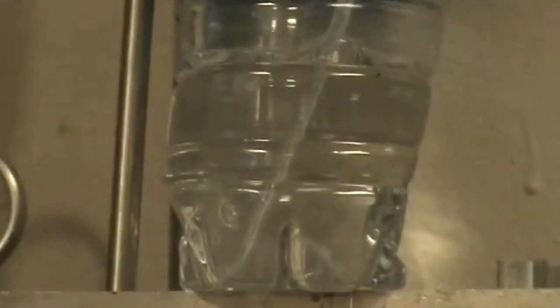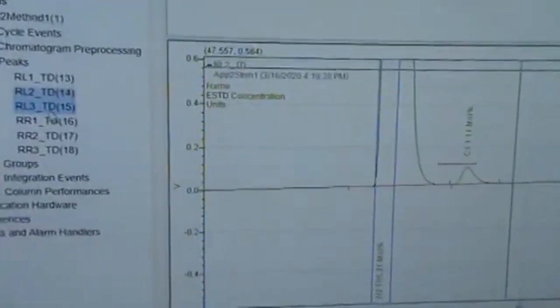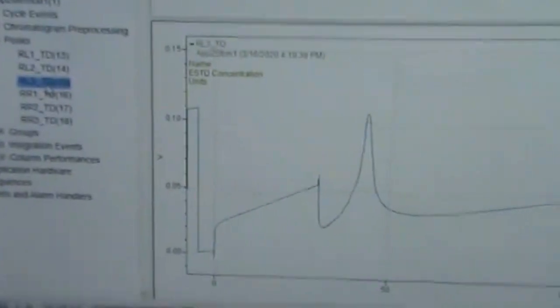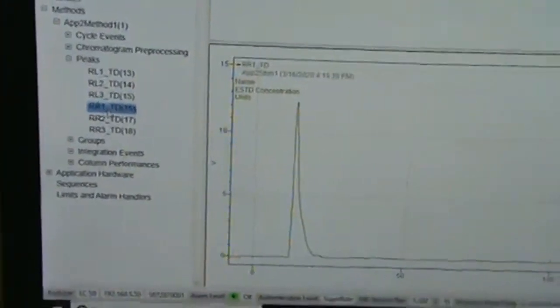We are purging. Right, left 3 is our back flush detector, and we are definitely back flushing. And we are doing this at time 30, 29.5, so basically, yeah, let me get a little bit better there. Yeah, time 30. And then right 1, pre-cut.